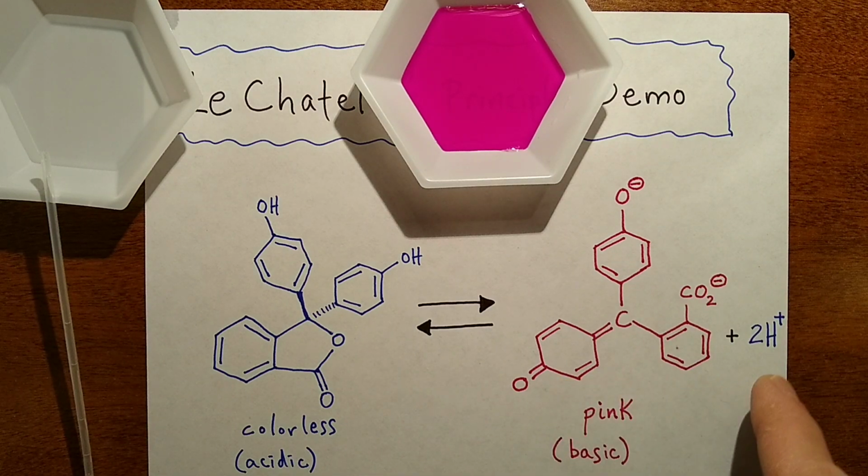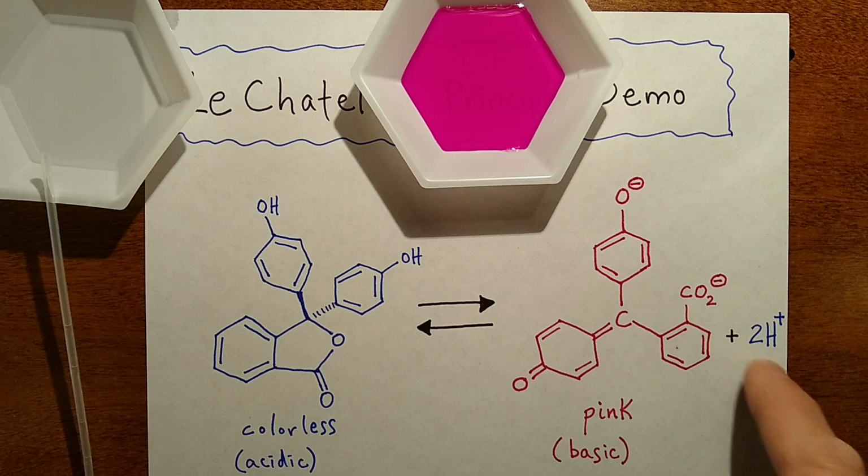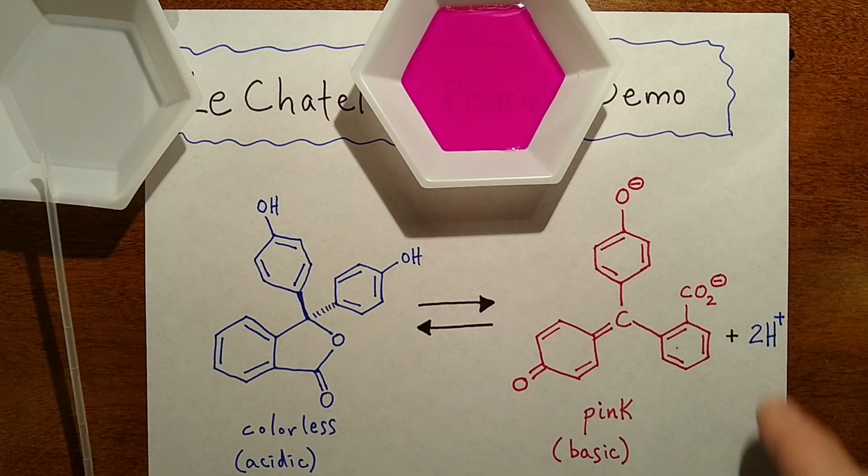But now I've shifted the equilibrium to the right by adding OH ions. I've removed these. That's Le Chatelier's principle. If I remove a product by taking it out, the equilibrium shifts to the right. So remove a product, I shift it to the right. You can also cause a shift to the right by adding a reactant. But what's going on here is I'm removing a product, and I'm causing the equilibrium to shift in this direction to compensate for the removal of the protons.